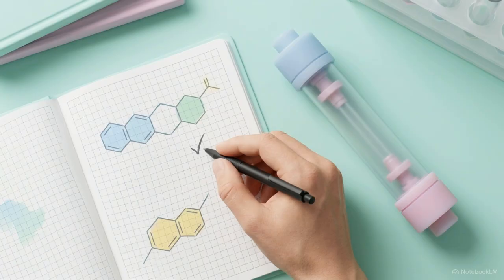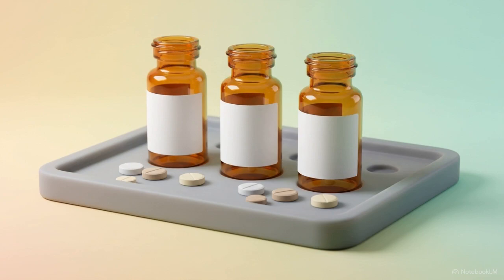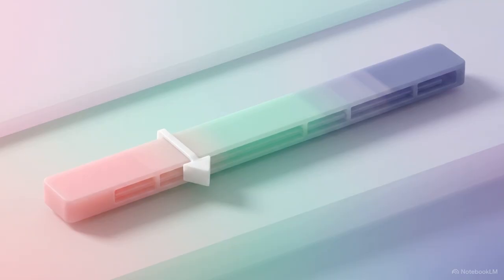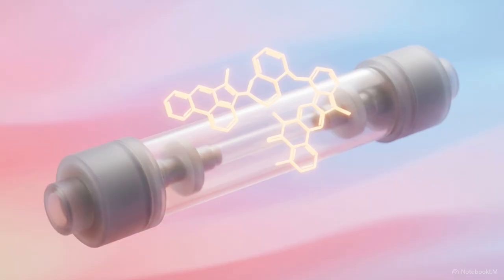This mechanism makes the ODS column ideal for analyzing moderately polar to nonpolar compounds, things like paracetamol, ibuprofen, or vitamin E. It provides predictable hydrophobic interactions, making it an economical and highly effective choice as long as your target compounds are neutral or acidic. That predictability drops off sharply when you try to analyze basic drugs, like amines or alkaloids.